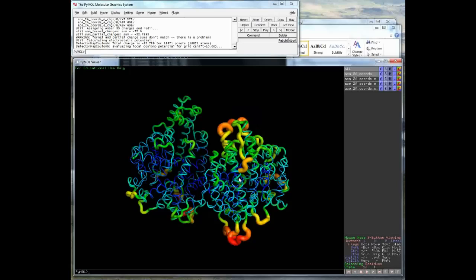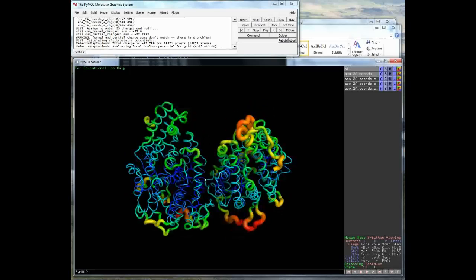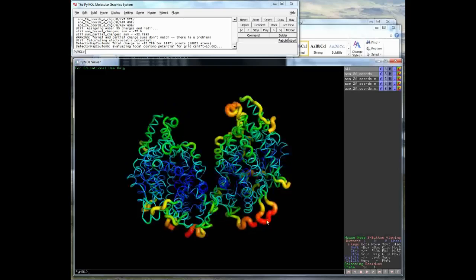What this view does is it colours atoms by B factor. So where atoms have low B factors, that means we're very sure of where they are, they have low disorder, then they're coloured in this blue colour. It's a rainbow scale, and green is somewhere in the middle. And where you have these red and yellow atoms in these loops around here, these atoms are much more disordered.